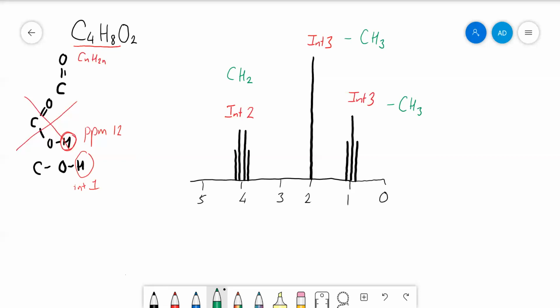And in addition to that, we know we've also got a carbonyl, and if you look at the number of oxygens about, well, we've got another oxygen, haven't we? So I think that this is probably going to be an ester. So now the only thing we have to do is put all that together and see if it fits in with the spectrum.